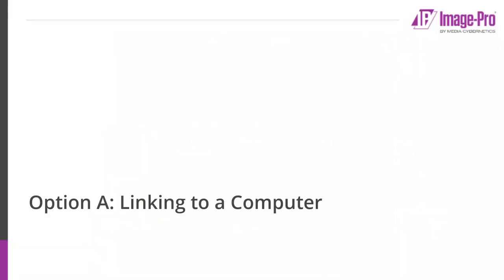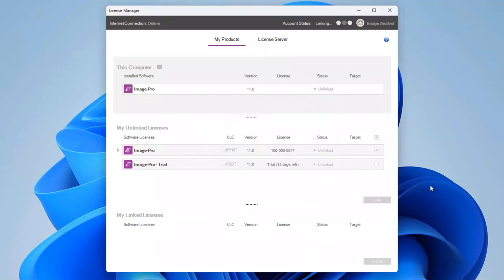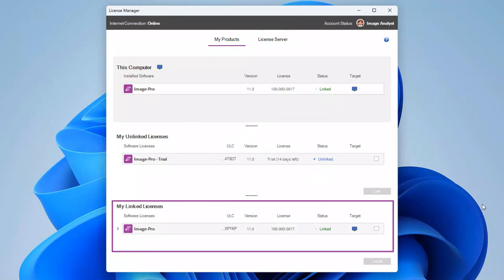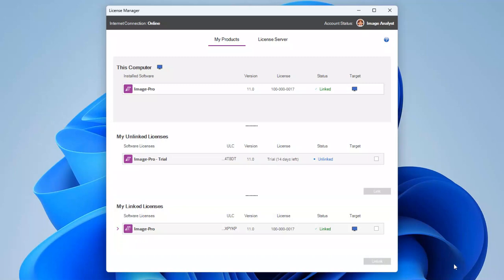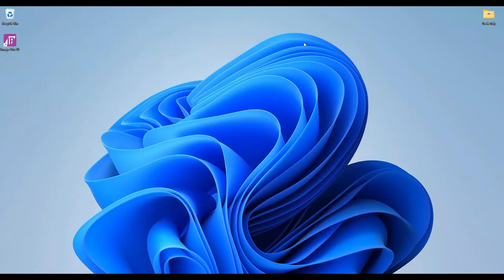We'll start by linking a license bundle to a computer, so I'm leaving the default selection as Computer and clicking OK. After a short delay, the License Manager updates and your license bundle is displayed in the My Linked Licenses table. The computer icon is shown in the Target column. ImagePro will now open fully licensed.